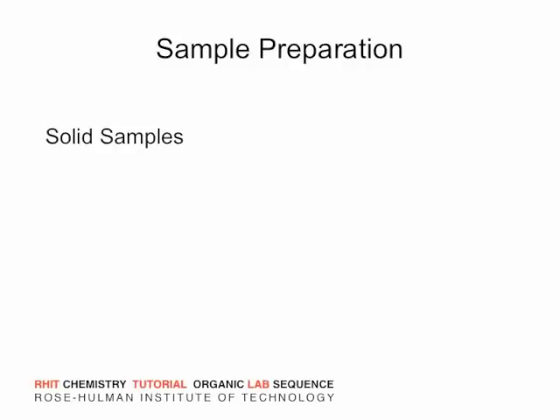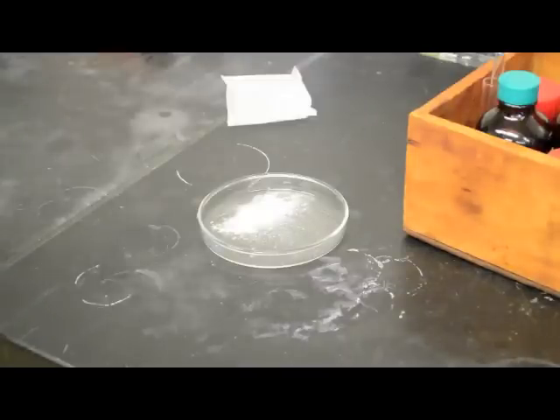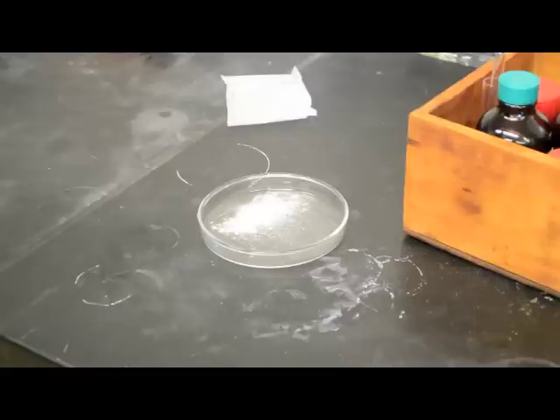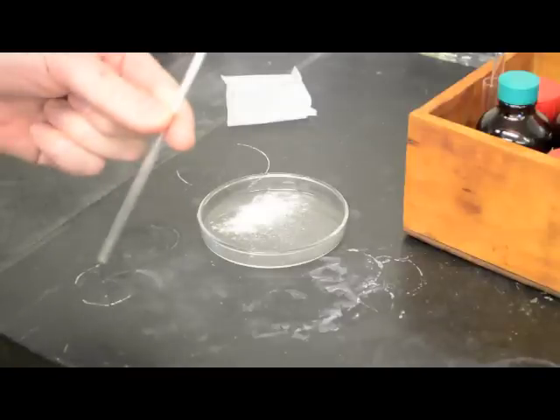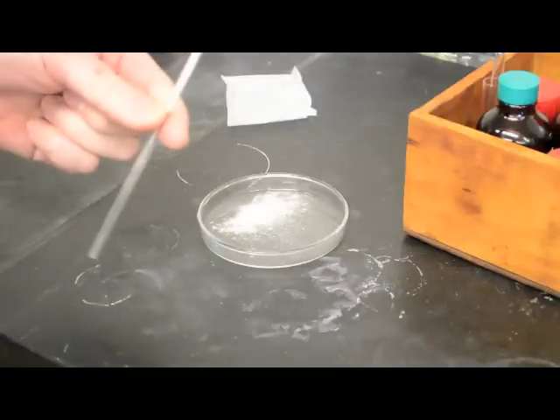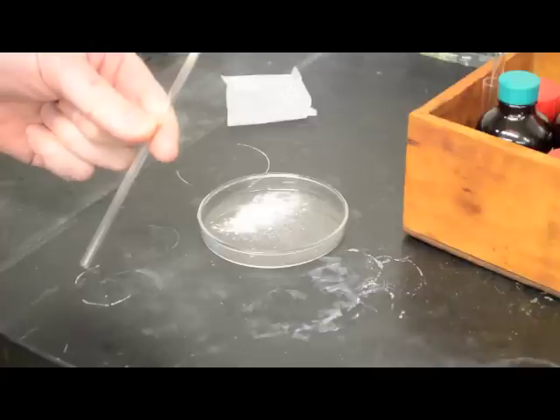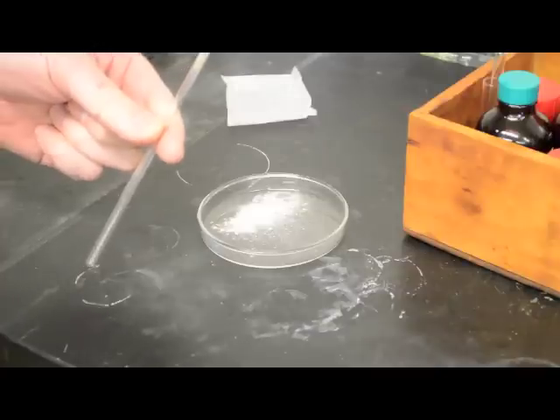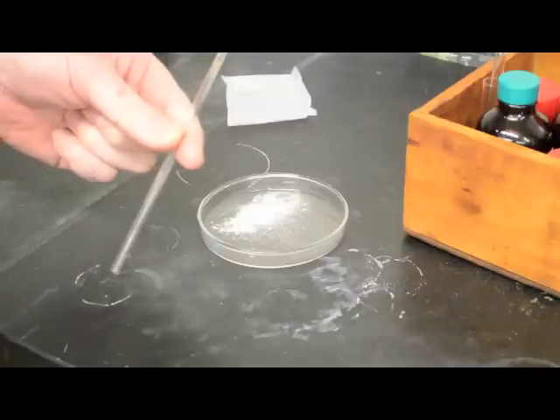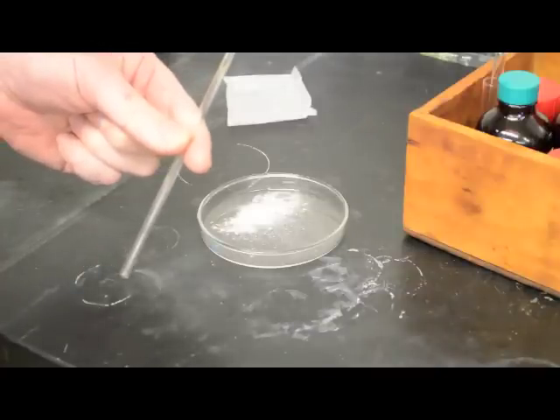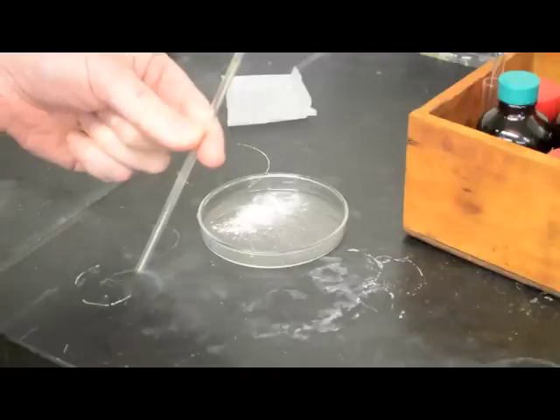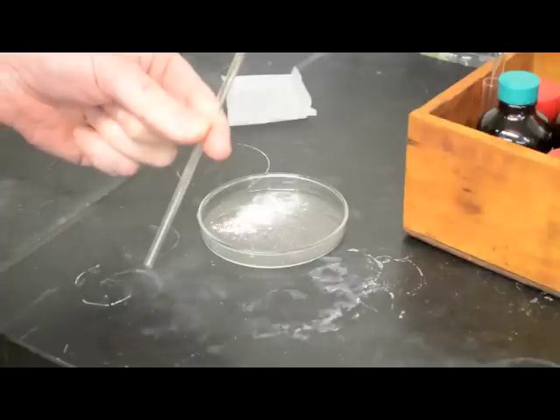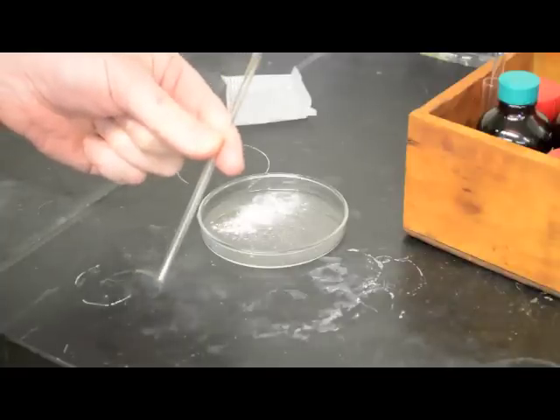The method for preparing the sample for NMR depends upon the type of sample. I have a solid sample on this petri dish. To run NMR, the sample must be in an NMR tube, which is essentially a long narrow tube. The NMR tubes are made to high tolerances because they have to spin at 1200 RPM. In consequence, they are fairly expensive. They cost about $5 a piece, so please be careful with them.